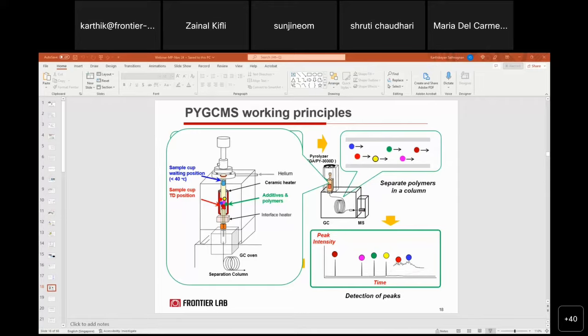Okay, for certain polymers like PET, even thermally assisted hydrolysis is recommended. So for getting a distinct peak, for example, if you look at the PET direct pyrolysis, you have multiple peaks. Whereas if you do it with methylation, you have a very special unique peak, so that can be used for your identification.